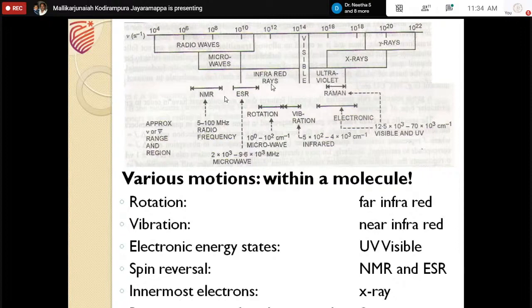Now we will go backwards from infrared, to frequencies lower than that of infrared rays, where we consider the spin of a given material. This portion of the electromagnetic spectrum we call radio frequency and microwave frequency, where we consider the magnetic component associated with electrons and nucleons, and how well they interact with electromagnetic radiation.